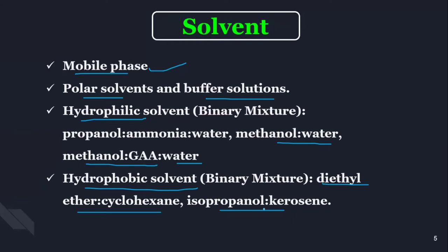Generally, three-component solvents are prepared, which I already mentioned over here, like in the hydrophilic: propanol, ammonia, and water. So it depends. The important solvent systems used for developing the chromatogram depend again, as I said, on what your application is.